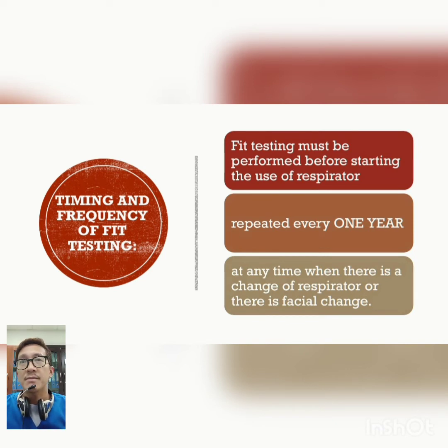How often are we going to conduct fit tests? Fit testing must be performed before starting the use of a respirator and must be repeated every year according to the Occupational Safety and Health Administration, or OSHA. Fit testing must also be repeated any time there is a change of respirator or a facial change. Examples are the use of a different size or model of respirator, or a new available type of N95 mask that you were not able to fit test with.